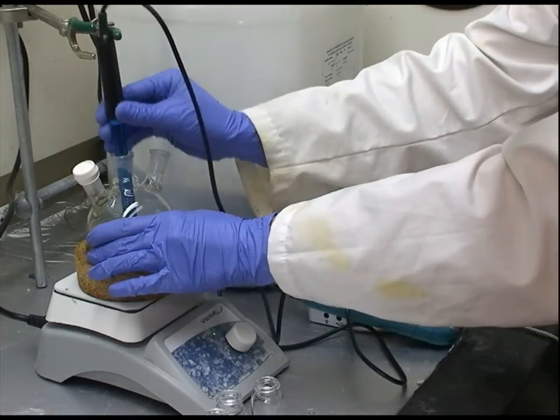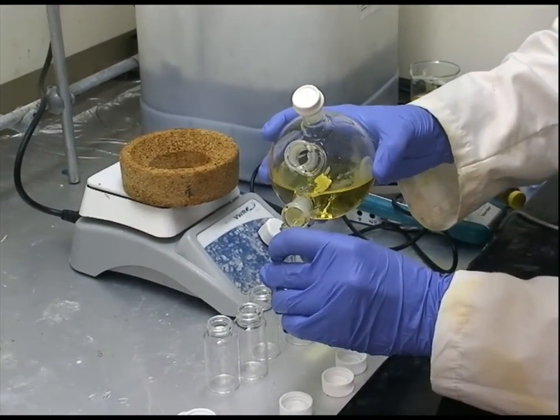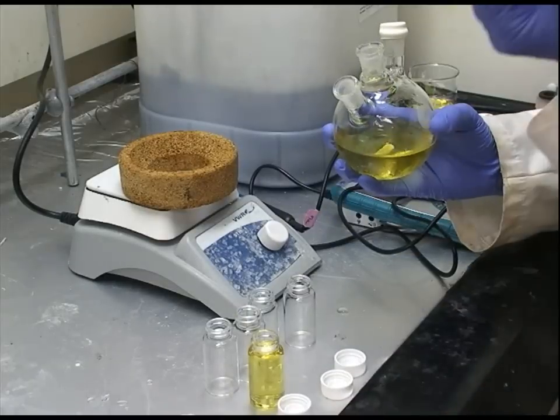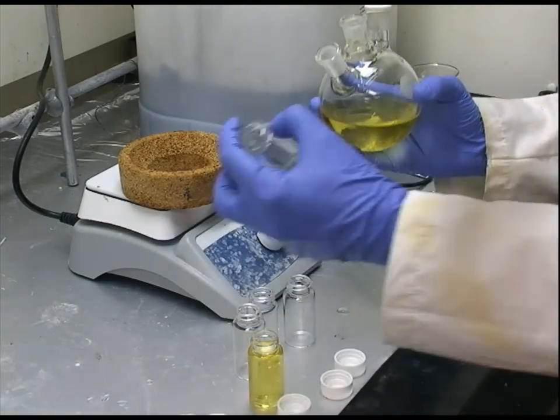After adjusting the pH we pour the solution into small cleaned vials. It is important to use a plastic or Teflon cap because a metal-lined cap will react with the solution.